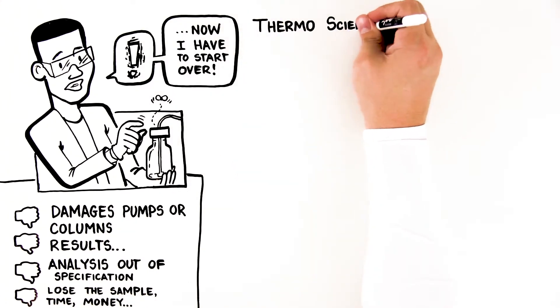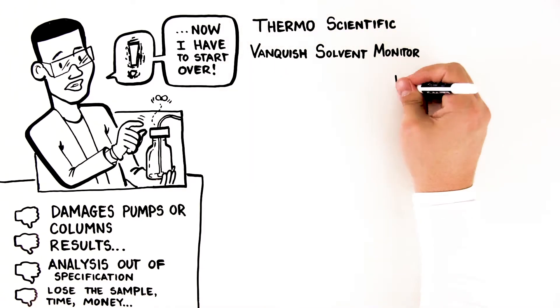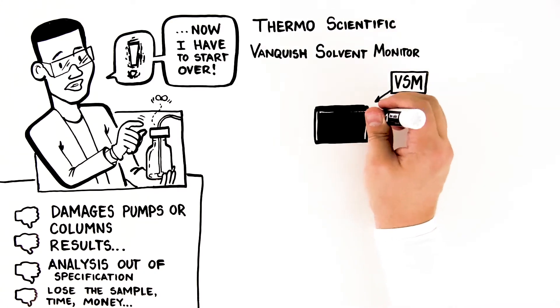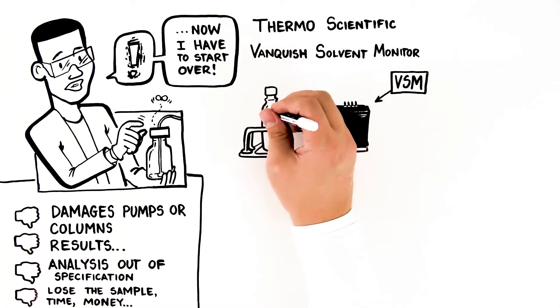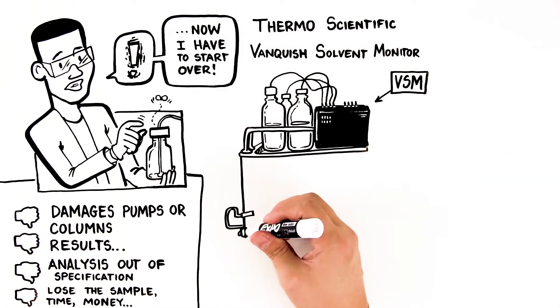The Thermo Scientific Vanquish Solvent Monitor helps make sure that never happens. The Vanquish Solvent Monitor, or VSM, ensures that you always have enough solvent to run your entire batch of samples, so your lab becomes more efficient and safer, and you're much less likely to do damage to your system.